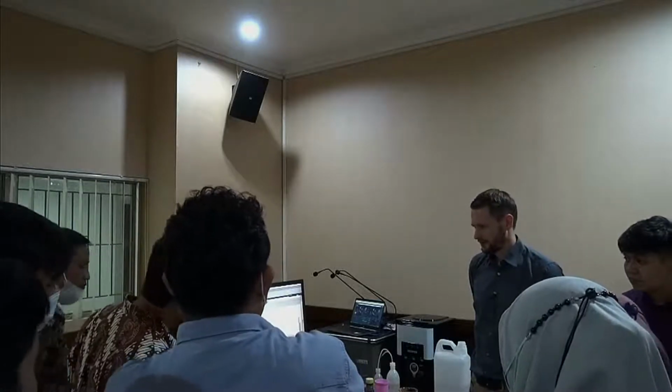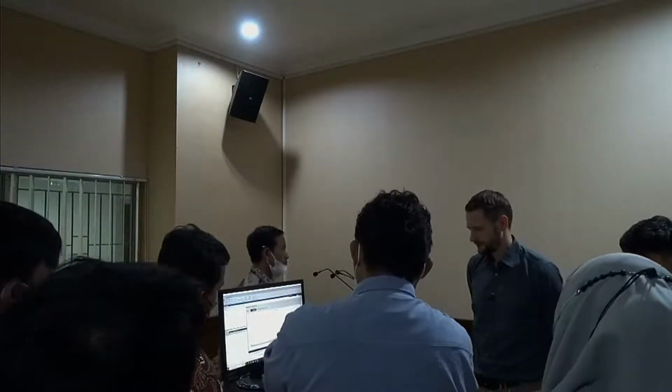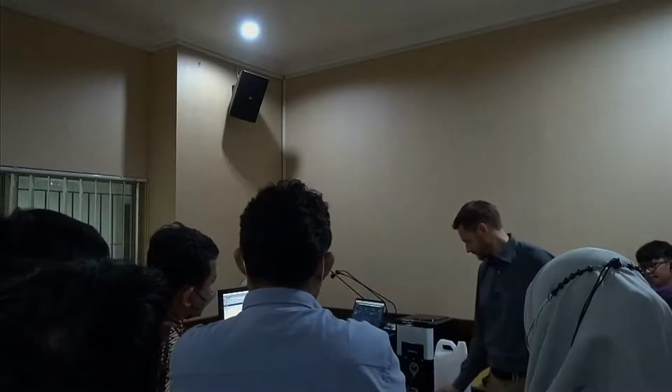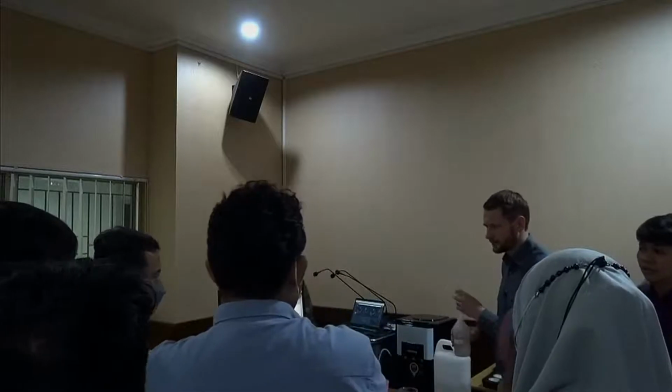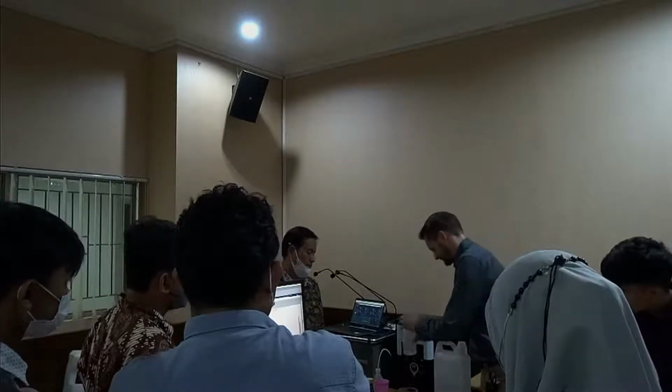And now the first result is in. Third measurement on the way. I should get ready for the cleaning.